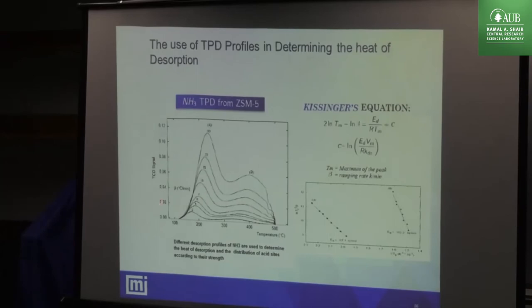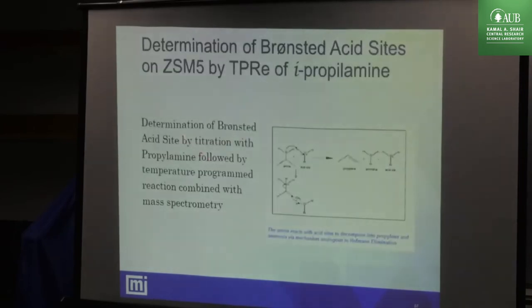Okay, but this you have to adsorb and desorb, and you have to have an analytical system, TCD or mass spec, to see what's going on in your desorption. Okay, nowadays nobody uses ammonia for acidity. Okay, you can read papers, nobody is using ammonia.